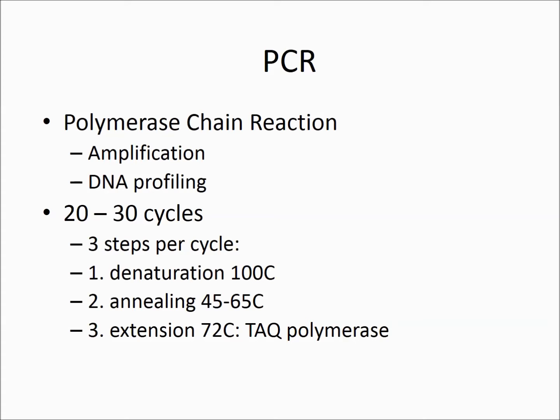In this reaction, DNA is amplified, that is, new DNA is synthesized, and this requires an enzyme called Taq polymerase. Our own enzymes would not be able to do this. They would be denatured at those temperatures. What's so special about Taq polymerase, it was identified first in bacteria that are thermoresistant and are capable of surviving those high temperatures. PCR is done in a special machine called a thermocycler that rapidly increases and decreases the temperatures of the 3 steps in the cycle.